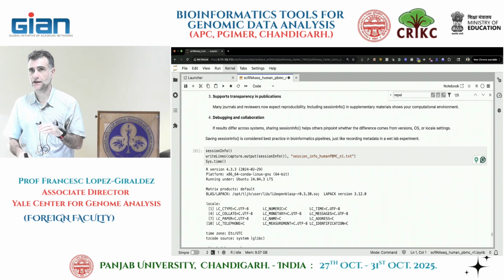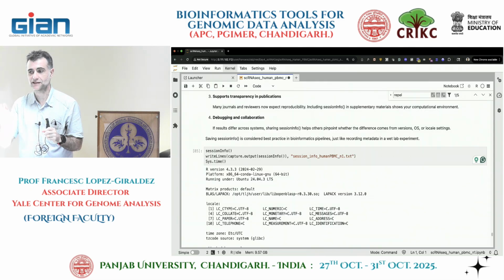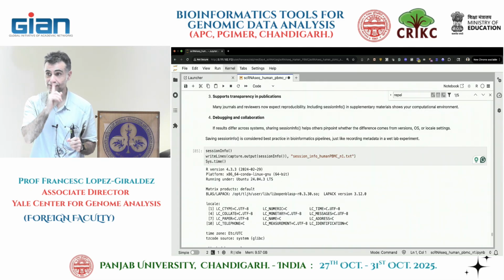It's never been there for Azimuth. So when you provide Seurat to Azimuth, your classification of clusters is not taken into account for anything. It goes cell by cell. In the previous exercise, SingleR takes a whole cluster and tries to tell you what it is. In this case, it takes only one cell, cell by cell.